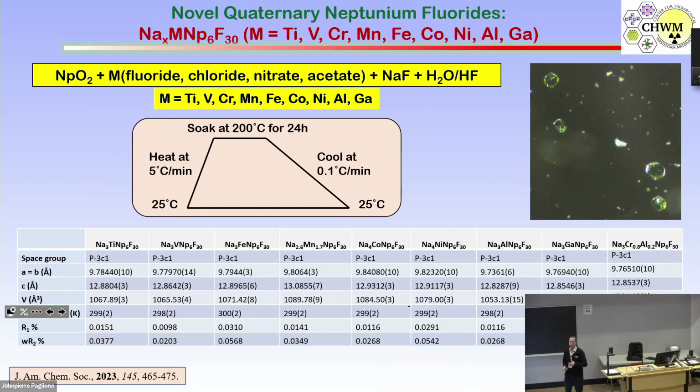Now this was all worked out, not with neptunium, but with other reagents. But you get nice crystals. And the other thing to notice is we're limited to 5 milligrams of neptunium per reaction. So we actually have different Teflon inserts. They're very shallow, so they're mostly solid Teflon. So there's a lower volume that we use.